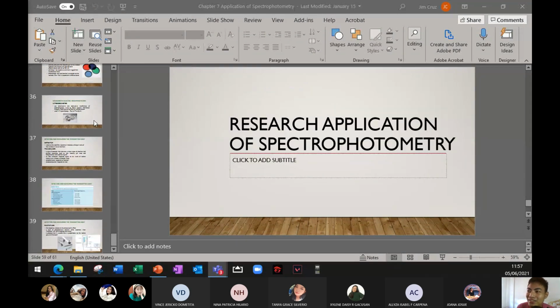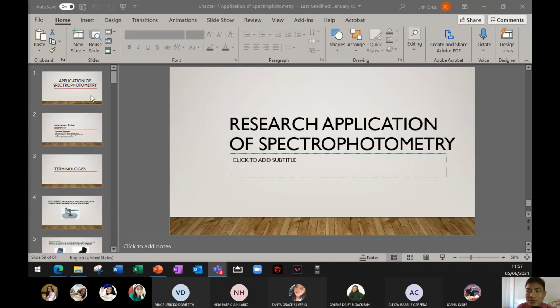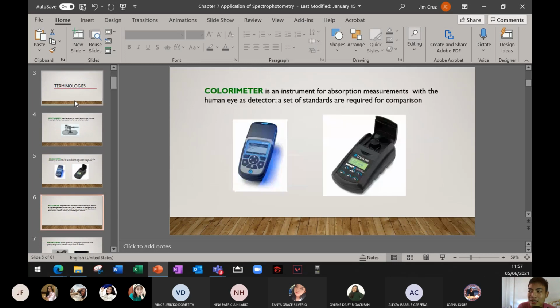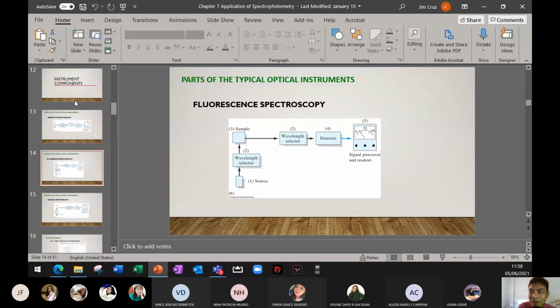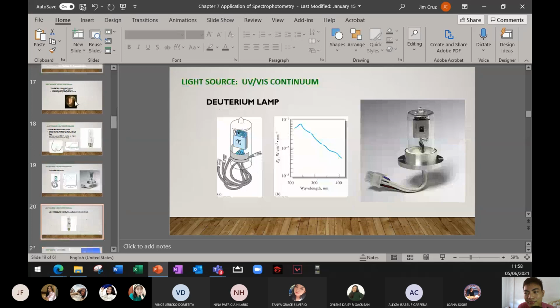Ang takeaways natin dito is ang spectral photometer important sa ating field because this can actually help us in quantifying substances. No? Marami tayong pwedeng magawa dito. Quantification, identification ng elements, no? Or even functional groups. No? So yan, na-discuss natin yung maraming parts niya. So yan yung mga parts. Yung mga in-emphasize ko kanina, kapag fluorescence, 90 degrees dapat, no? Remember that na lang. Okay?